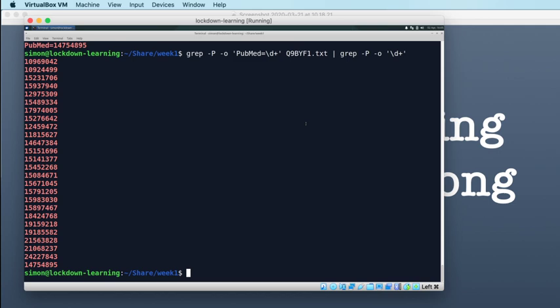So sed is a command, it's SED, which stands for stream editor. So sed is a way of editing an input stream, so of making changes to an input stream. It's a relatively clever tool that's quite difficult to get to grips with, and it's not a tool I use very often, but I figured out a way that we could do this with sed.